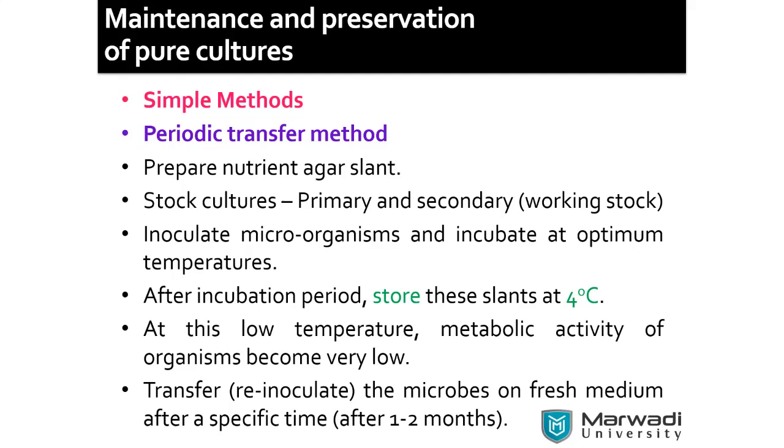While microbial work is going on in this area, during the preservation span, stable power supply is mandatory, and maintenance of every instrument is also required. Sometimes we may go for continuous monitoring. AMC is also taken.